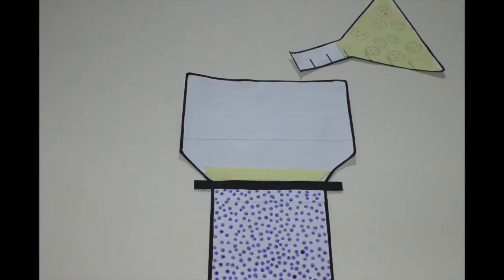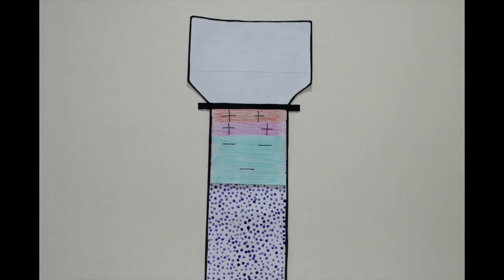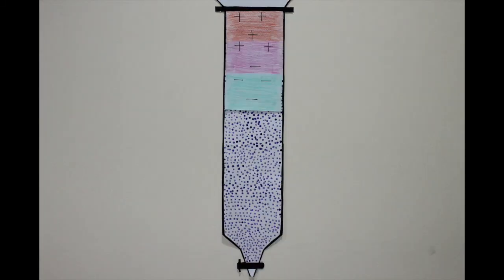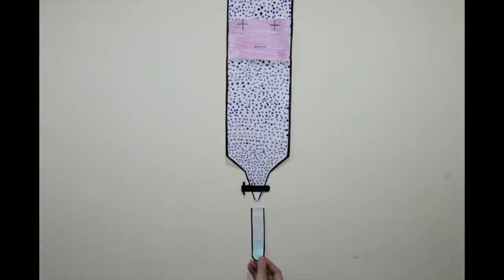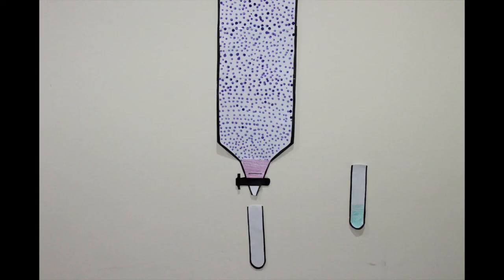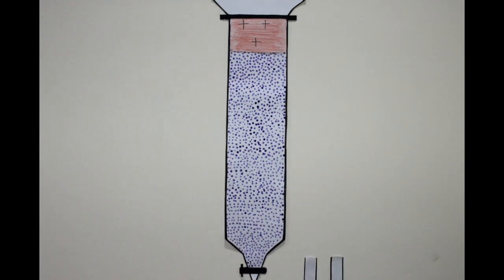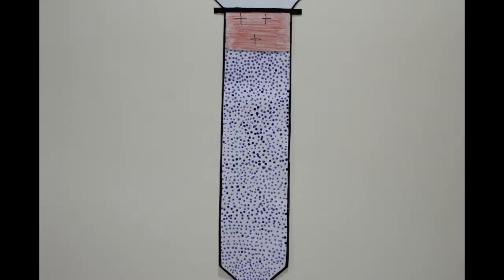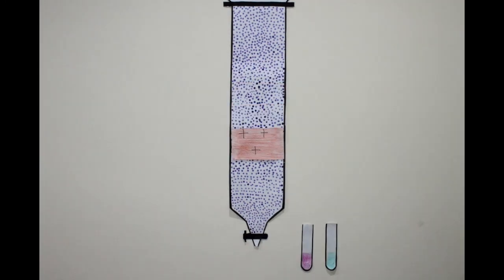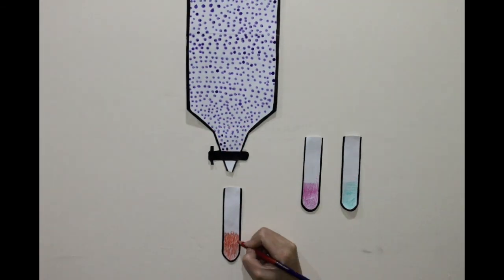Initially, the supernatant is at the top of the column and will move down the column due to gravitational force. But their difference in net charge causes them to move at different rates. Negatively charged protein is collected first, followed by slightly positive protein. In the column still remains the very positive protein. It's trapped in the column due to high interaction with the beads. Pouring the salt solution will break the electric interaction between the beads and the very positive protein, which is IgY. Then we can collect the IgY.